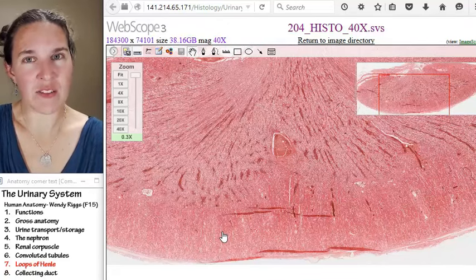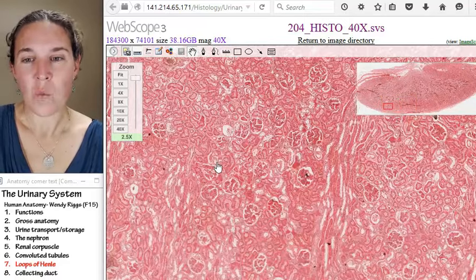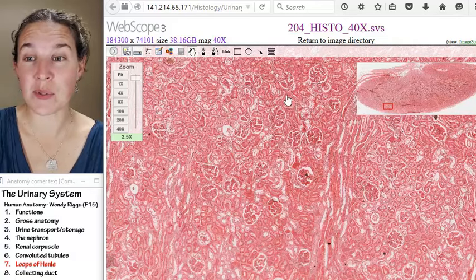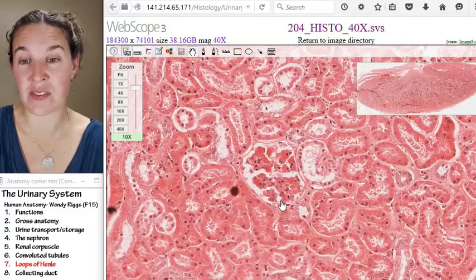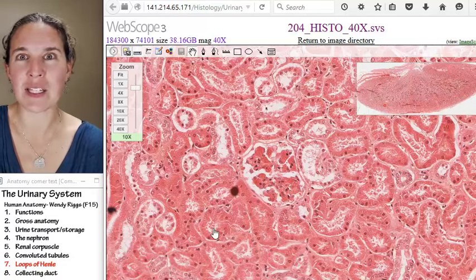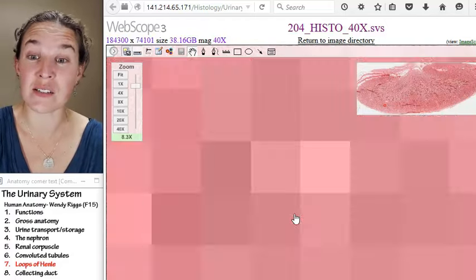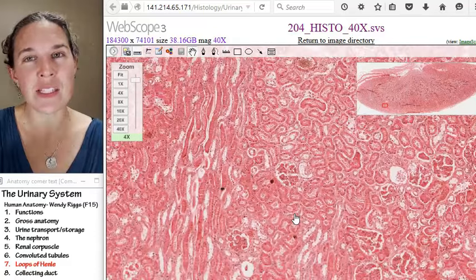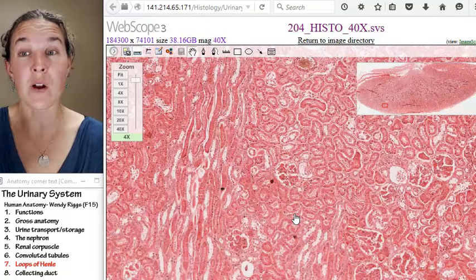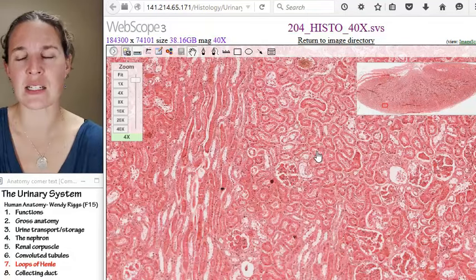What structures are we going to expect to find in the cortex? Well, right away, you can see them already — we know we're going to expect to find renal corpuscles, Bowman's capsule with the knot of glomerular capillaries, and sure enough, we can. We could totally spend time in here labeling these in the cortex as either proximal convoluted tubules or distal convoluted tubules. We also have some collecting ducts in here receiving the filtrate from the distal convoluted tubule, because the distal convoluted tubules have to dump in somewhere, and the collecting ducts start up there.